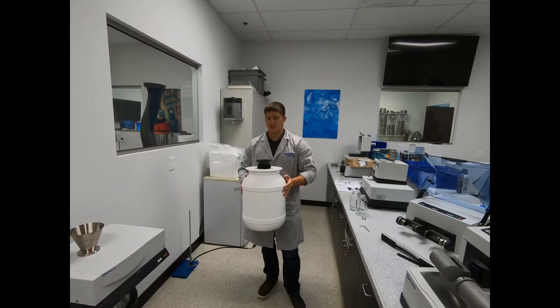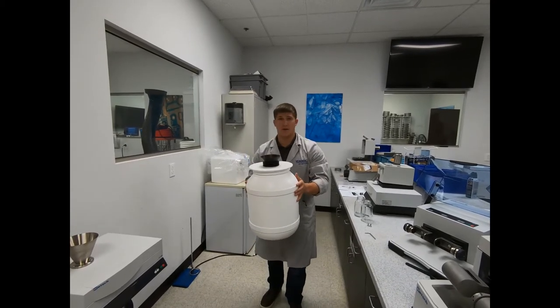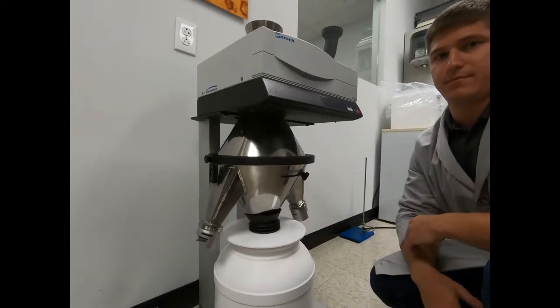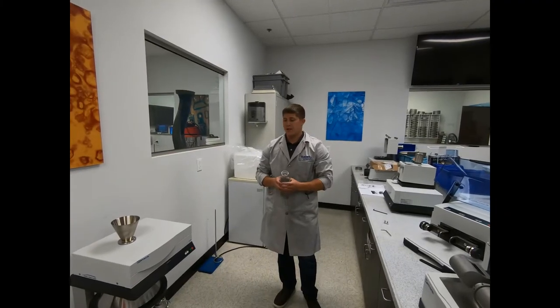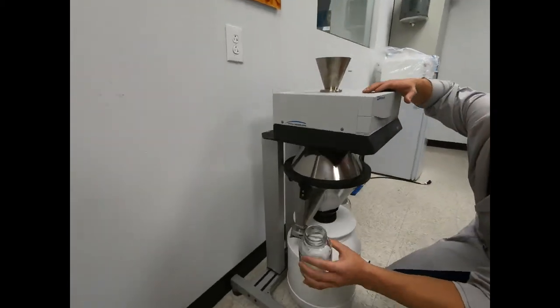Once the bottom cone is installed, what you're going to want to do next is install your reject collector and lid into the bottom of the bottom cone. Once your reject collector is installed, you're going to want to install your sample bottle into the corresponding outlet.